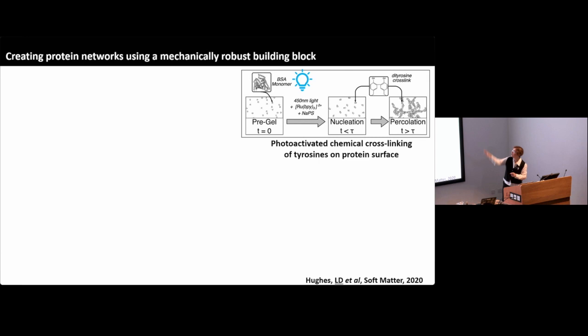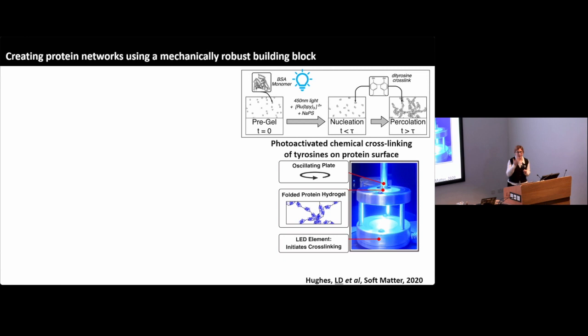So if you look through to the right, we have a nucleation event. These proteins come together. And in time, enough of these connections take place that you have a percolating network or a hydrogel. A hydrogel is a polymeric network in a water-rich environment. And at this point, the viscoelastic properties of your material change quite dramatically. So one of the ways that we study this is with rheology, which gives you a measure of the mechanics of a hydrogel. So, for example, we can do oscillatory rheology.